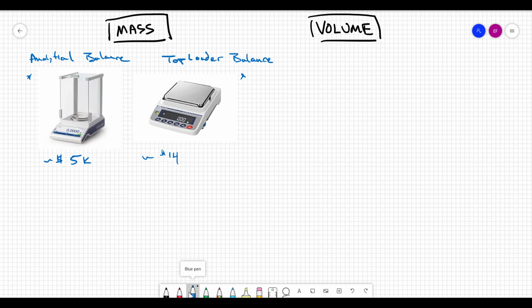So a typical analytical balance would run us around 0.000x grams, which means we're running out to about 1/10 of a milligram in terms of the readability or the ability to actually measure that value. Whereas a top loader can often, in the cheapest sense, run into the sort of 1/10 of a gram, but like yours can run nowadays, sensors are getting cheaper, can run out to the 100th gram, and one in my research lab, which cost about $200, can run out to the single milligram.